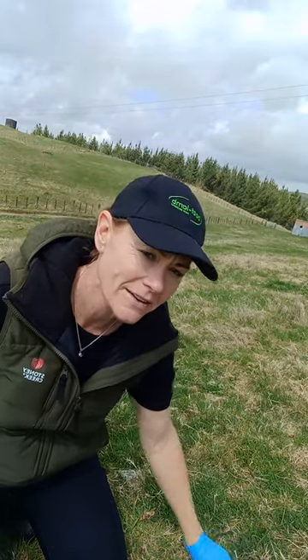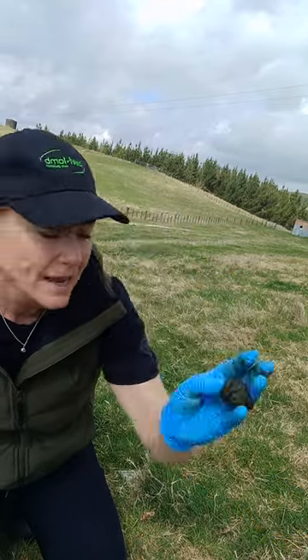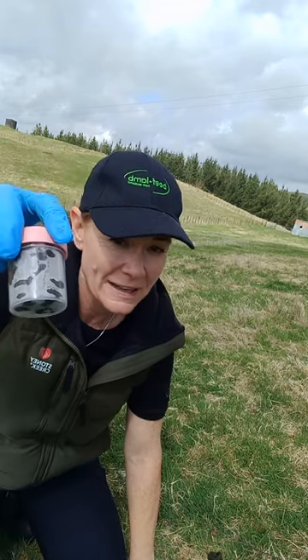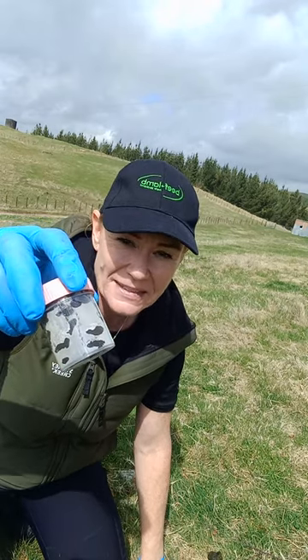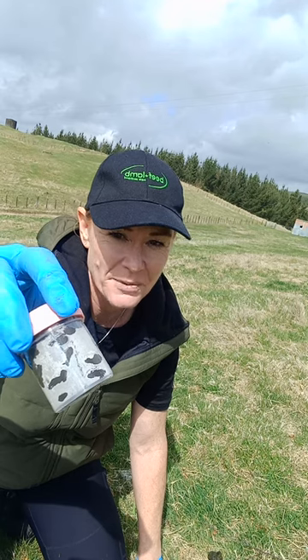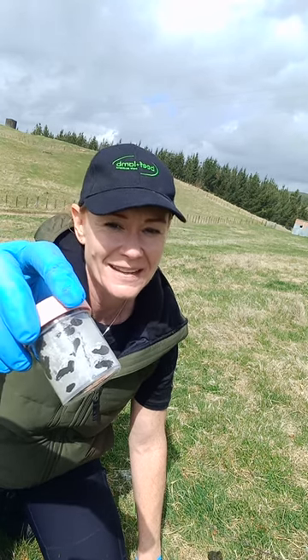10 grams minimum, so that's like about the size of a walnut, maybe sort of that much. But it is probably better if you can to completely fill up the pottles. Plenty of samples is always better than not enough, and as you can see with this one we've got nice steam there in the pottle, indicating that the sample is warm and fresh enough for the testing that's required.